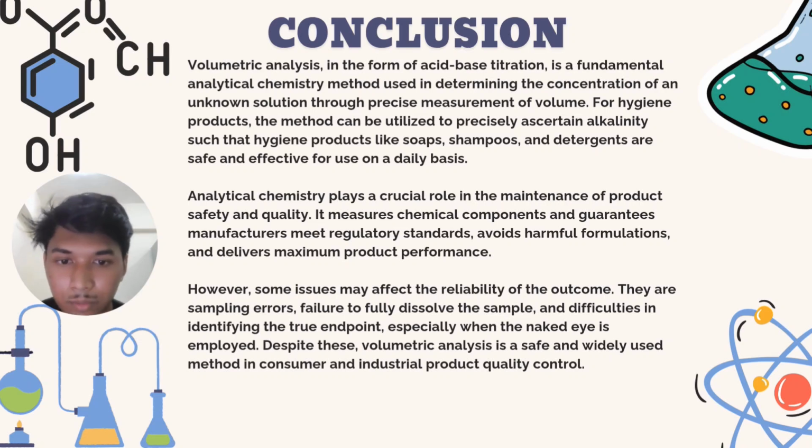However, some issues may affect the reliability of the outcome. There are sampling errors, failure to fully dissolve the sample, and difficulties in identifying the true endpoint, especially when the naked eye is employed. Despite this, volumetric analysis is a safe and widely used method in consumer and industrial product quality control.